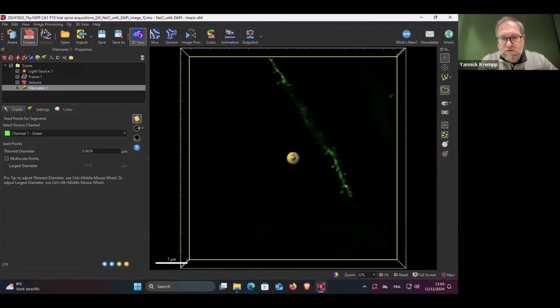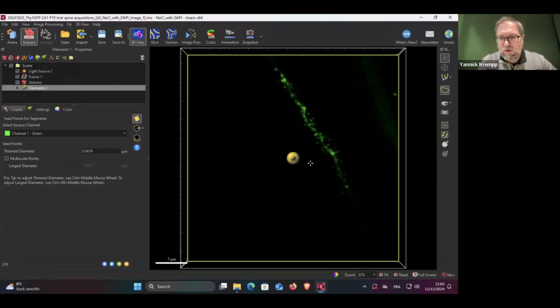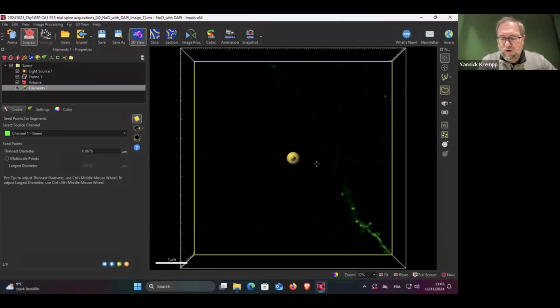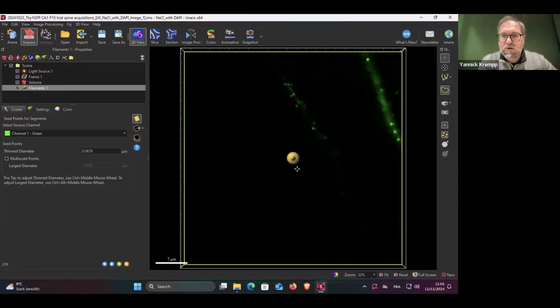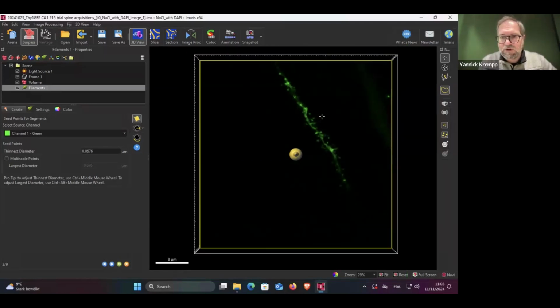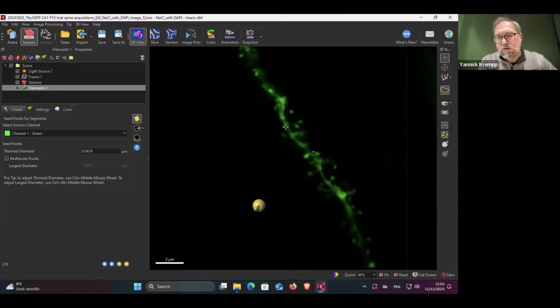Instead, grab the surrounding part here, and then by slowly moving between left and right with the mouse and keeping the left button clicked, you can move through your data set, like here. So this allows you to focus on a specific part of the image here. And it's maybe easier to follow the wizard here.